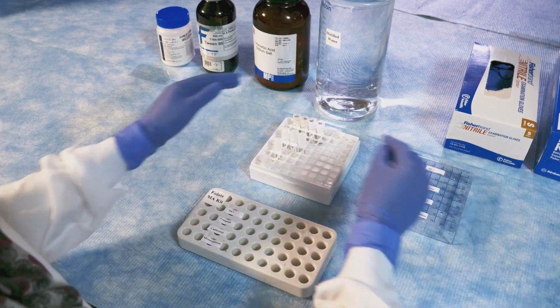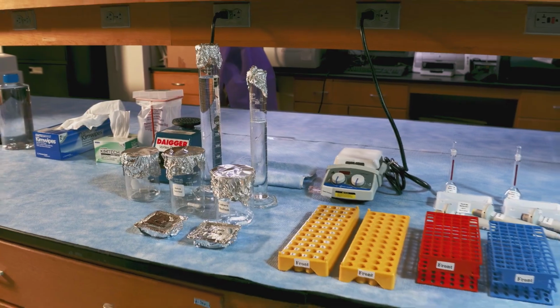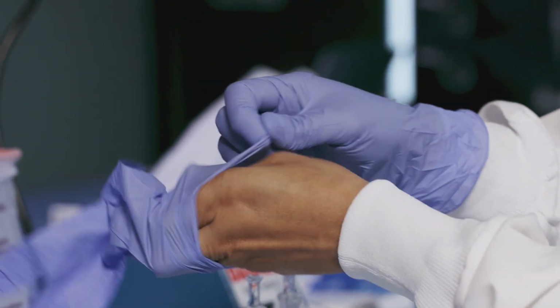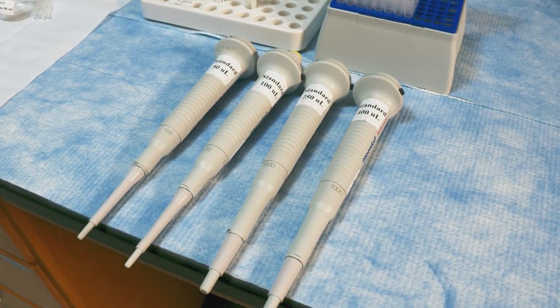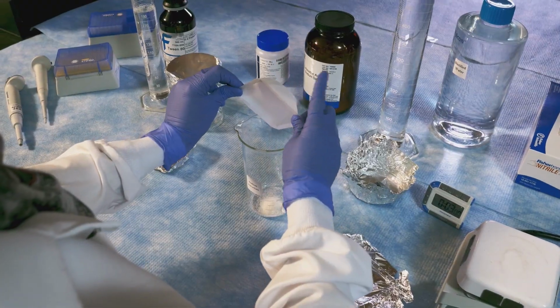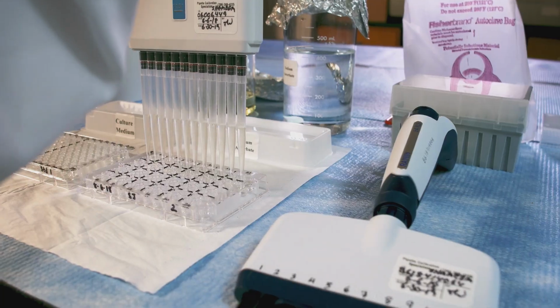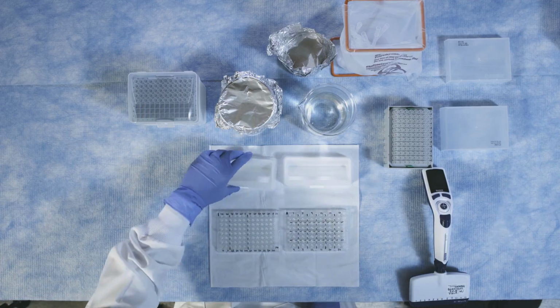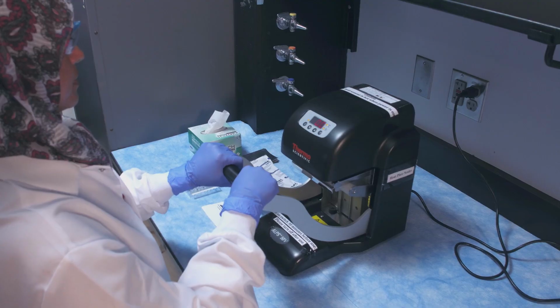This concludes our training video for the Folate Microbiologic Assay. It is important to remember that this assay is very sensitive at detecting trace levels of folate, and therefore you need to work carefully to prevent folate contamination. Use dedicated pipettes, glassware, and workbench to dilute the highly concentrated calibrator, and, if possible, a separate sink to clean up your reusable glassware. Also remember to regularly decontaminate the bench surface and pipettes used for sample preparation.